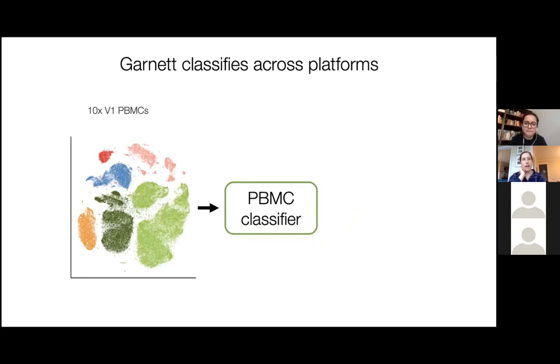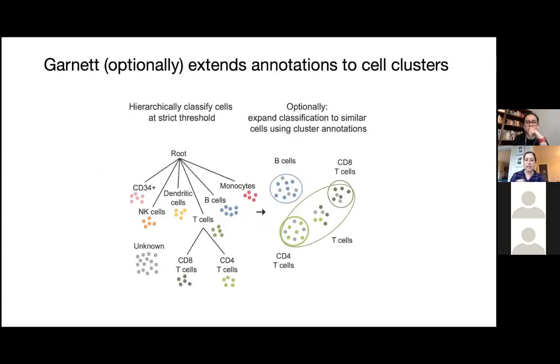Are there other ways that you can change the thresholds to reduce some of the unknown cell types, or try and get them assigned to their correct cell type? Yes. If you have expression data, either from single cell or bulk RNA-seq, then like I showed in the marker file, you can specify the expression thresholds and make them either lenient or strict, and have more cells be included in a particular cell type cluster.